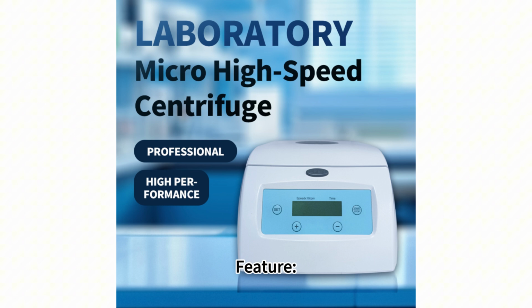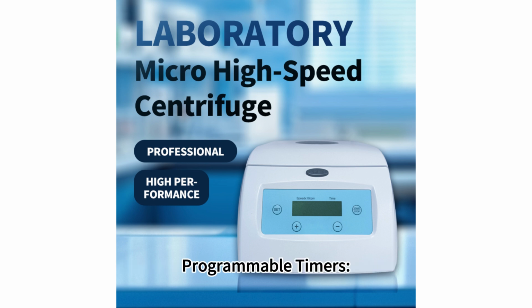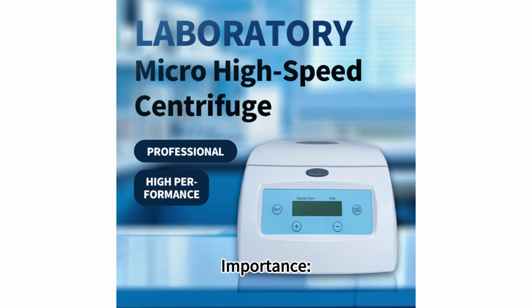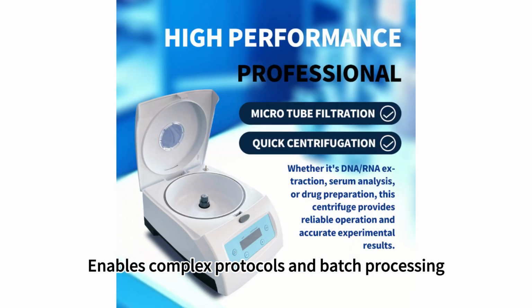Digital display feature. It displays the countdown time. Importance: it allows users to monitor the remaining time. Programmable timers feature. Some models offer programmable settings. Importance: this enables complex protocols and batch processing.